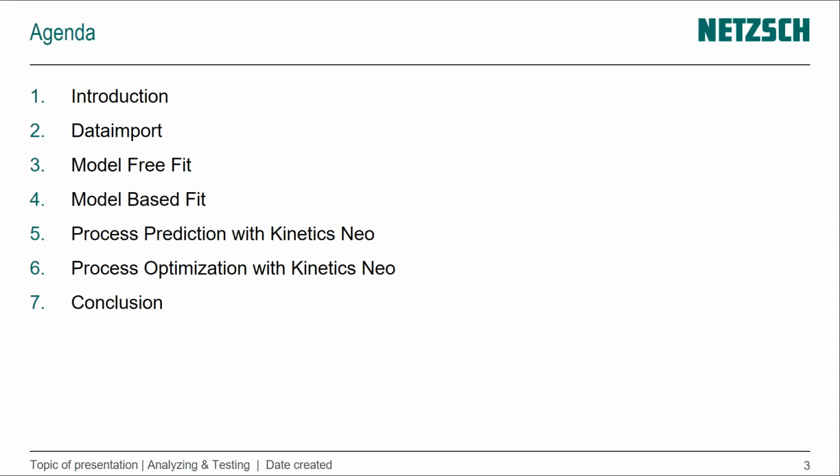In this webinar, I will give you a short introduction why the Kinetics Neo is helpful for your process. I will show you the data import into Kinetics Neo software, the model-free and the model-based fit from your results, the process prediction with Kinetics Neo, the process optimization, and at the end I will give you a short conclusion.